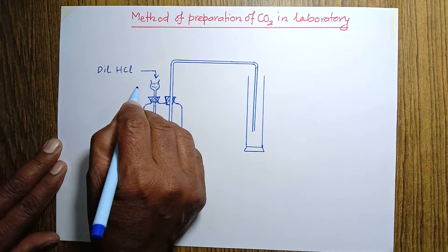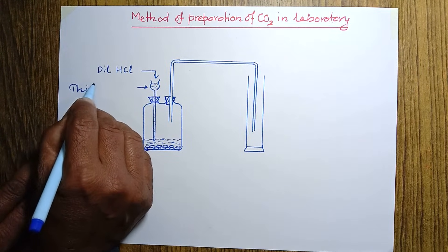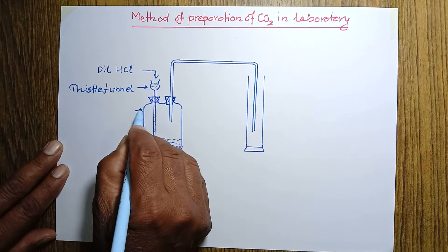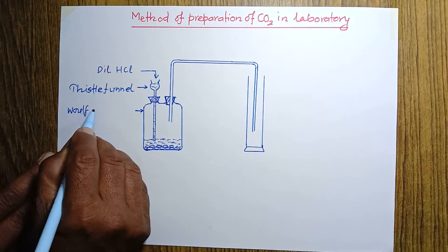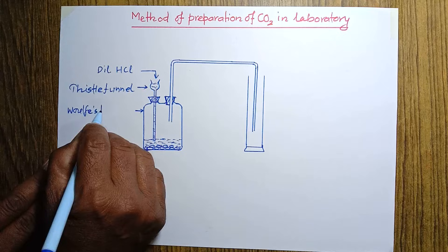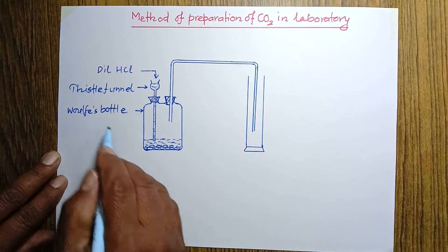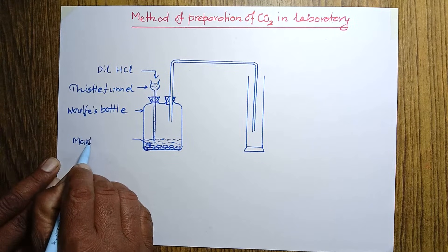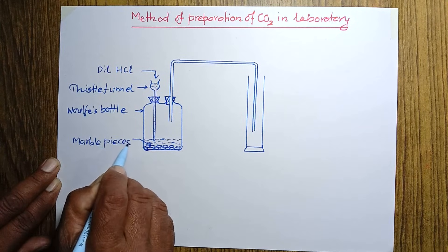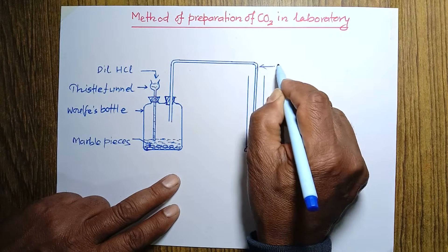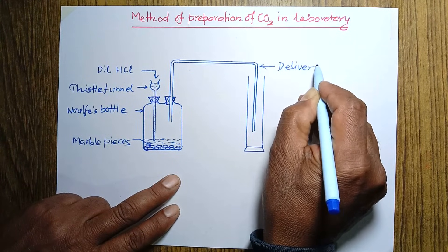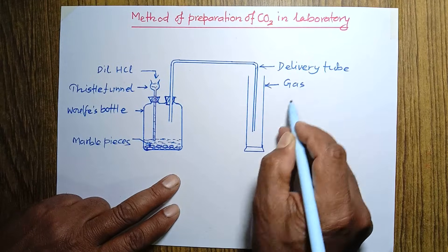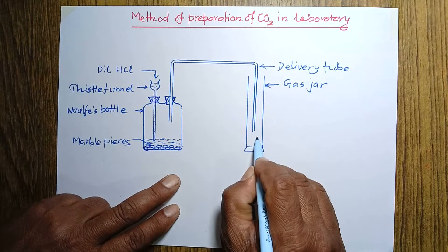This is the thistle funnel. This is the wolf bottle. These are marble pieces — we are using marble pieces here. This is the delivery tube. And this is the gas jar. And this is carbon dioxide gas.